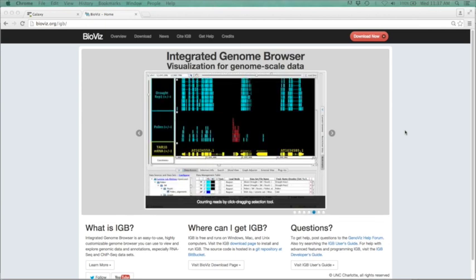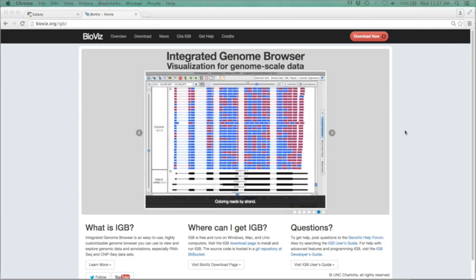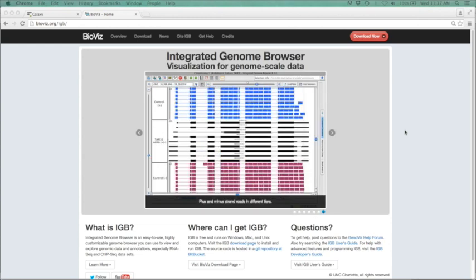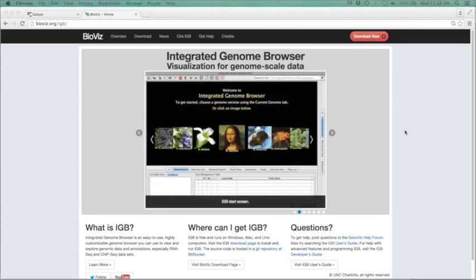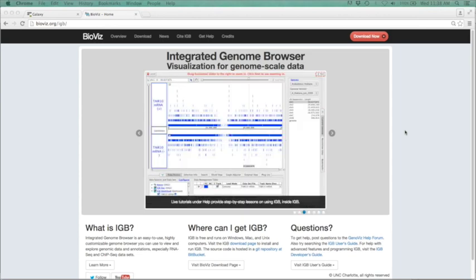ChIP-seq, or chromatin immunoprecipitation sequencing, is a technique often used to identify transcription factor binding locations. This is done by fixing protein to DNA, followed by shearing of that DNA, and then using an antibody to pull out the protein or transcription factor of interest, which is still attached to that DNA. We can then take that DNA and sequence it using next-gen sequencing. This FASTQ file then needs to be aligned to a reference genome, and areas of protein-DNA binding — otherwise known as peak calling — can be identified.